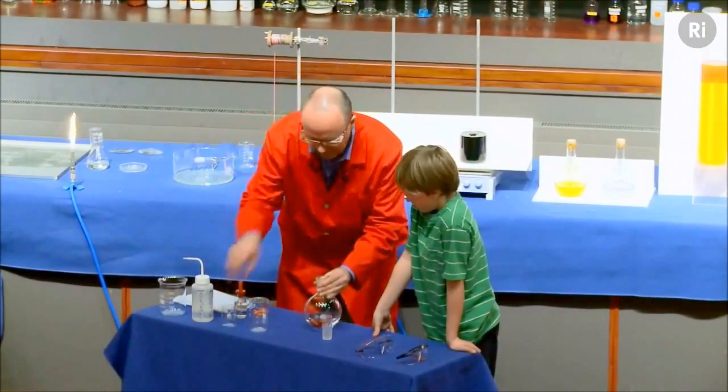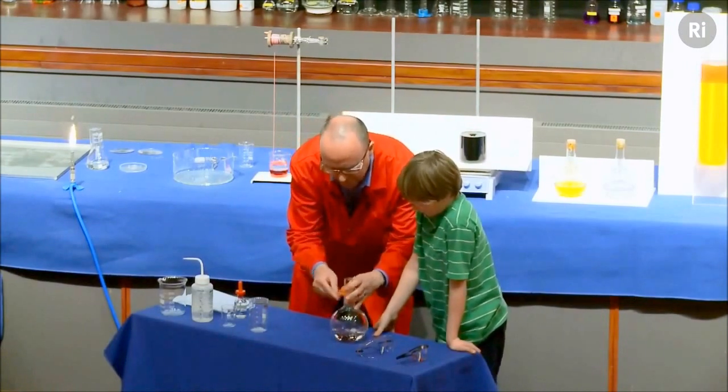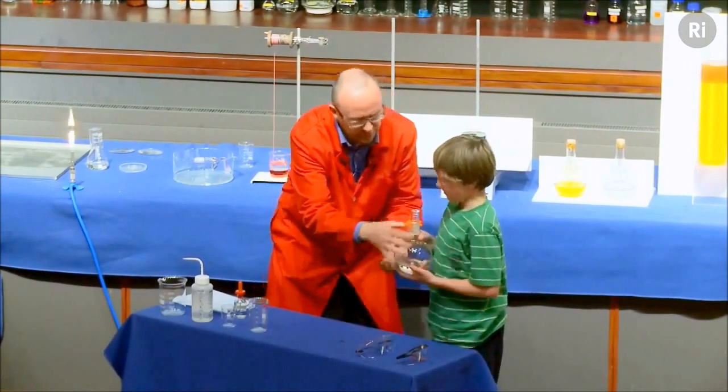So there's the glucose. Now I'm going to put the lid on and put a clip on. I'm going to give it to you, Dylan, and I want you to hold that. And I want you to give it a really good shake.